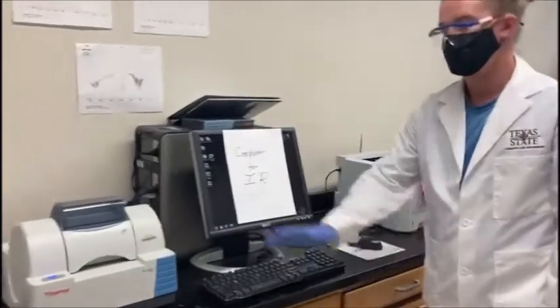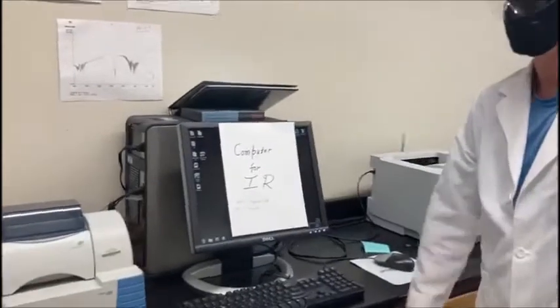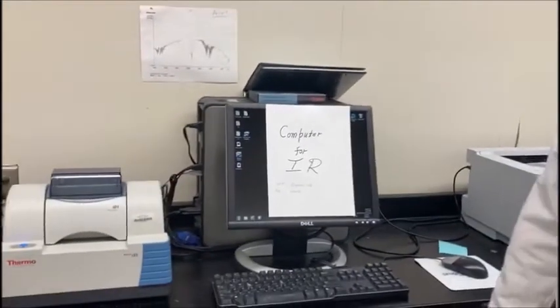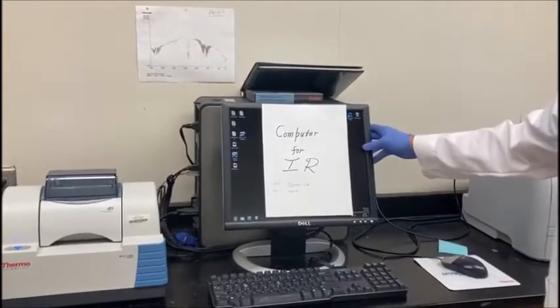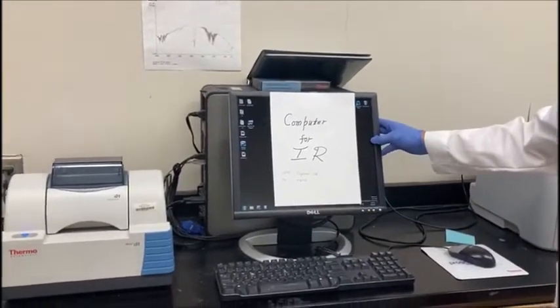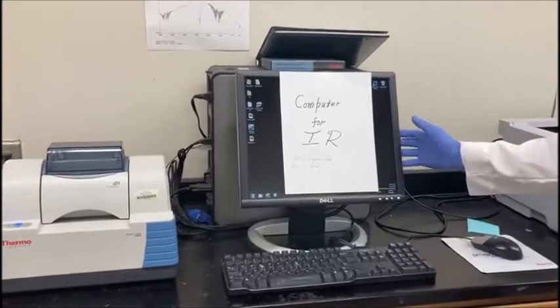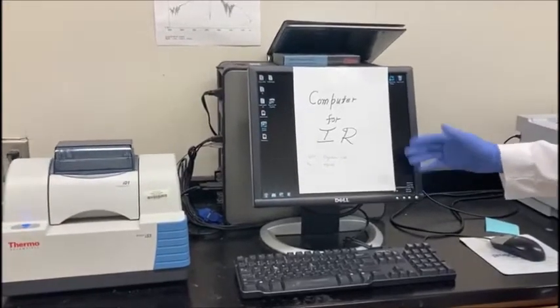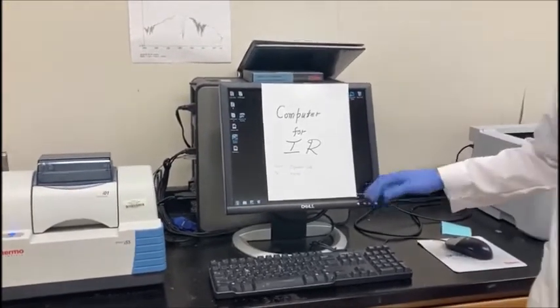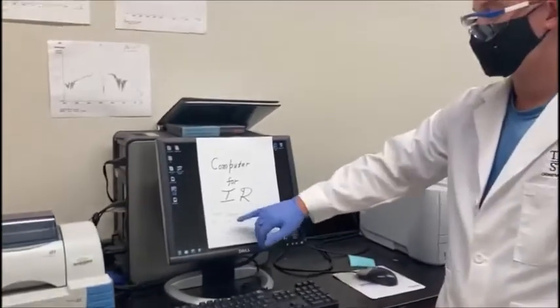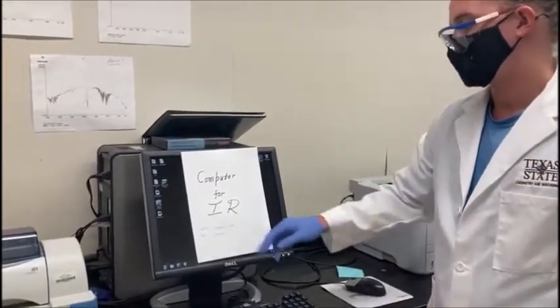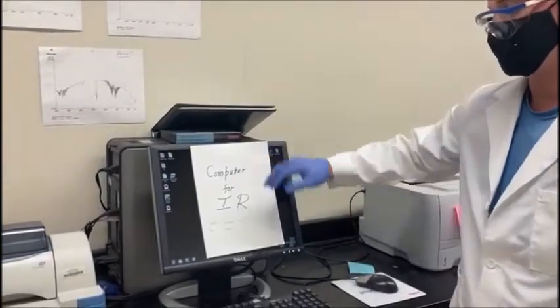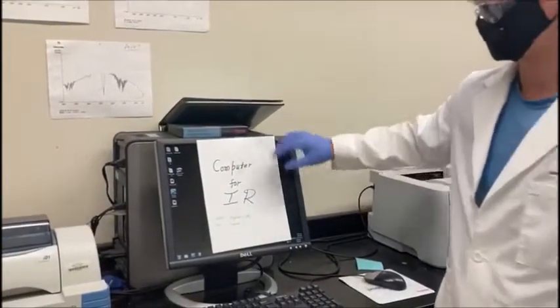Normally this should be logged in for you, but if it's ever not and you need to run an IR, the username is organic-lab and the password is organic.